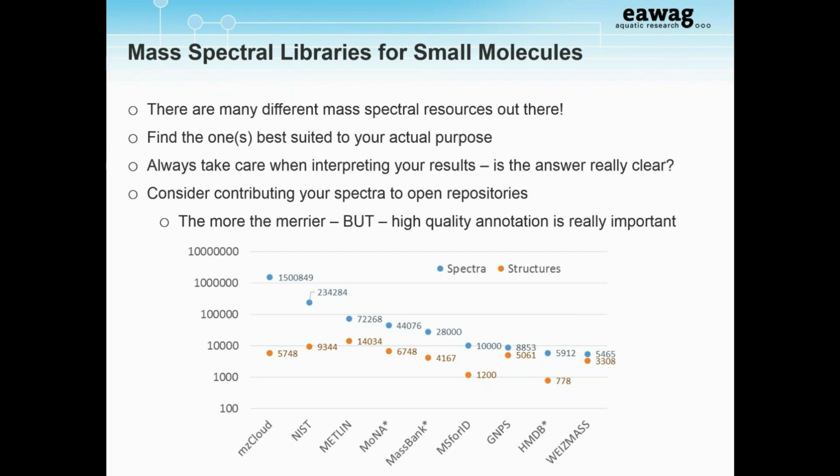If I may, I can add that one way to satisfy yourself as well is to take the structure and search in ChemSpider and PubChem compound libraries, which are huge. They contain a lot of compounds, and you can, absolutely, do a similarity search, for example, and pick out all the compounds higher than 95% similar, and have a look to see are there a lot of isomers, could these isomers be present in your sample as well. Following that, you could argue that you have a good hit but you're still not completely there, or you have a very unique hit and you're quite happy that it's that compound.